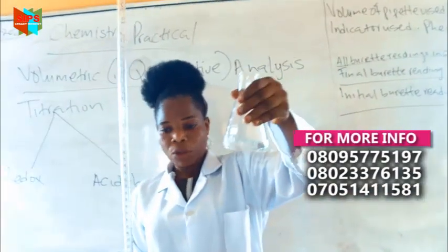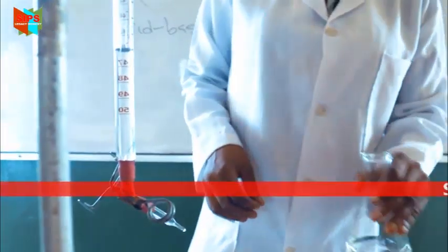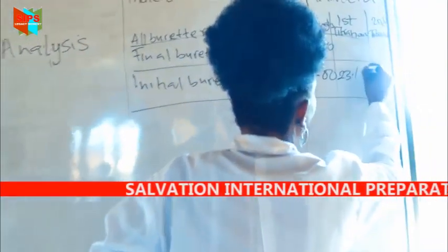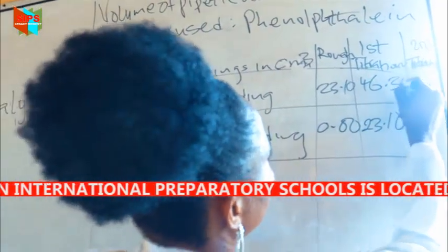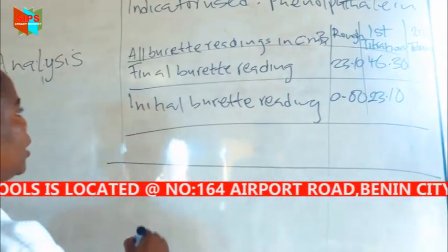At the end point, it is 46.3. I started from 23.10 and now I ended at 46.3.